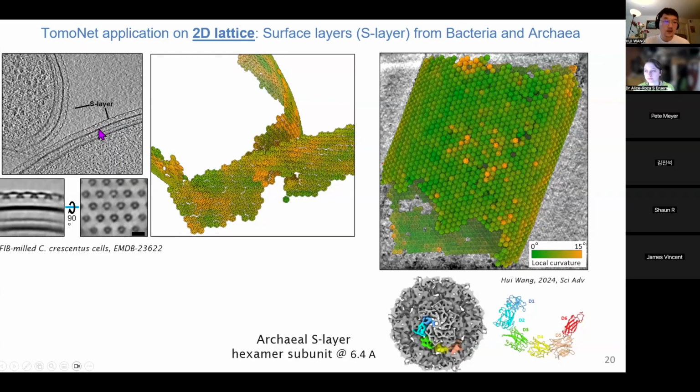So to avoid introducing those false positives, which theoretically have stronger density than the surface layer, they could easily be classified as positives if you just do global template matching. And from this placeback, you can also see that the particles are correctly picked and they strictly follow the hexagonal lattice pattern, and you can see those domains very well after you average them together.